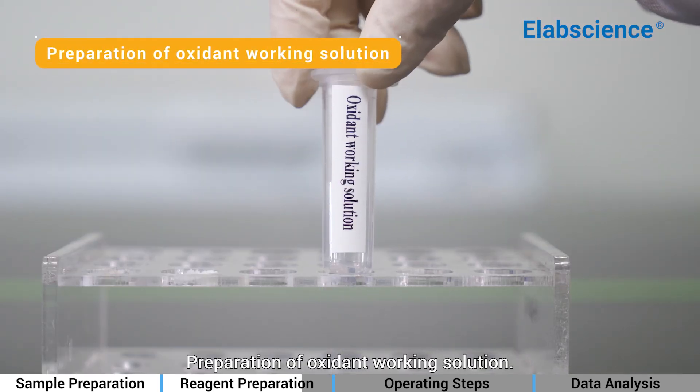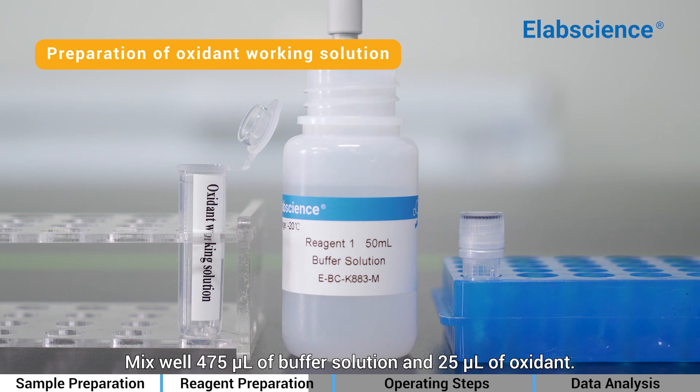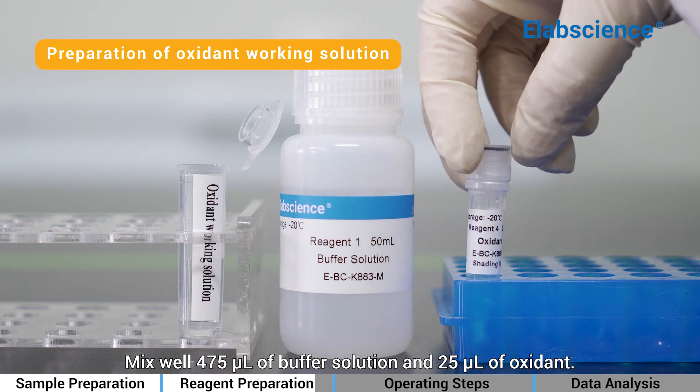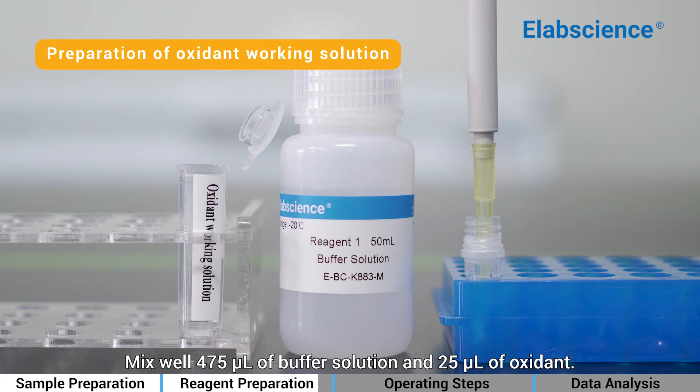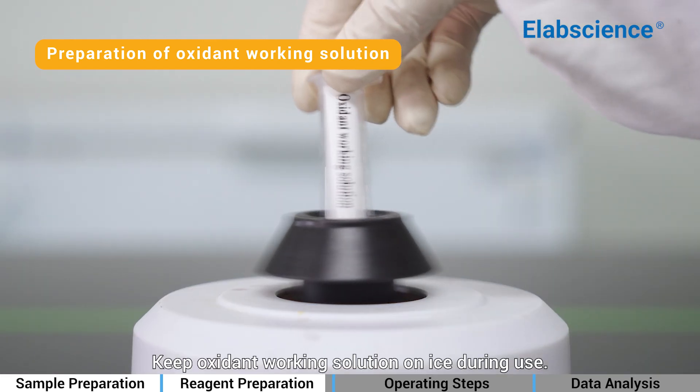Preparation of Oxidant Working Solution: Mix well 475 µL of buffer solution with 25 µL of oxidant. Keep the oxidant working solution on ice during use.